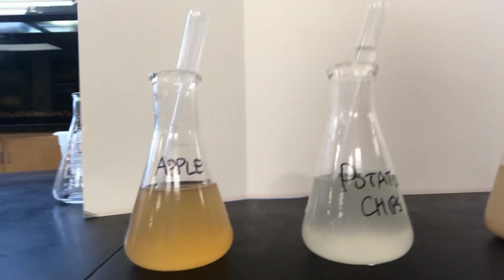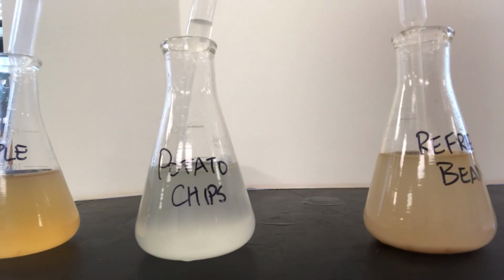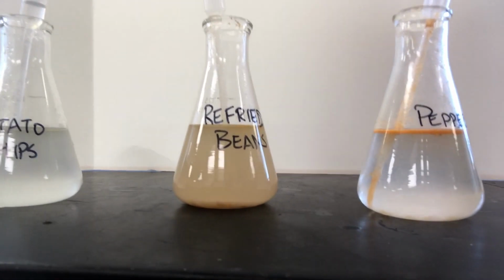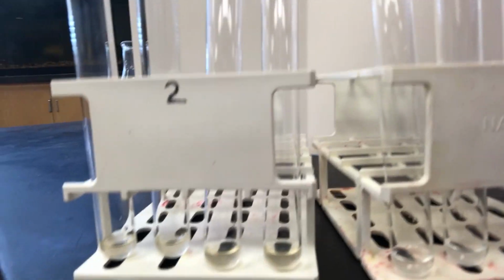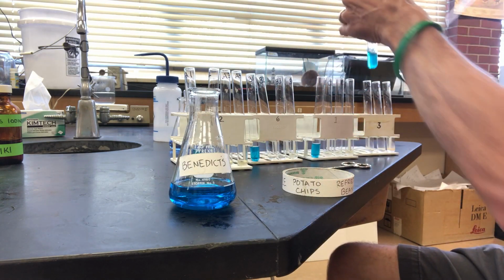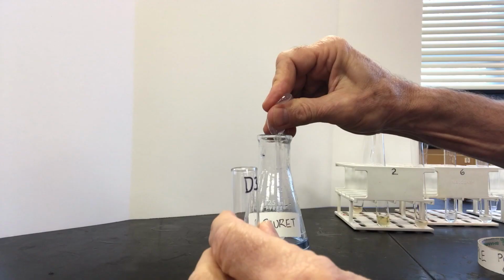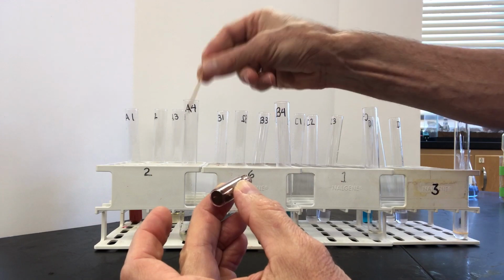After allowing the food mixtures to settle and solubilize for about 30 minutes, the liquid will be decanted into clean, labeled flasks and further diluted with 90 milliliters of water. This is important in order to reduce the intensity of the color of the sample liquid so that they don't interfere with the color of the test results. 1 milliliter of each sample solution is transferred to the appropriately labeled tube. Then each of the 4 tests are performed on the correspondingly labeled tubes. All of the number 1 tubes get the Benedict's test, all of the number 2 tubes get the iodine test, number 3 get the Biuret, and number 4 get the oil red O test.